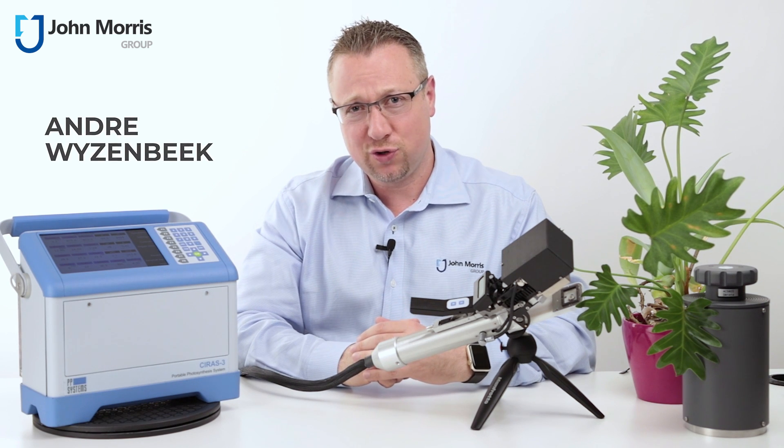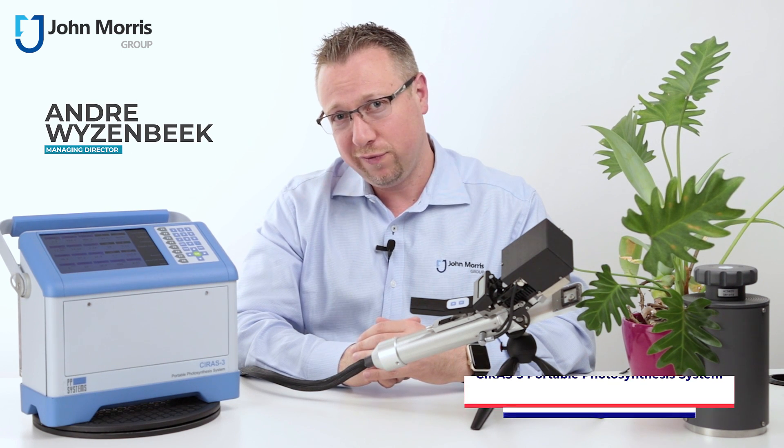Hi, I'm Andre from the John Morris Group, and today we're here to do a product review on the Cyrus III from PP Systems.